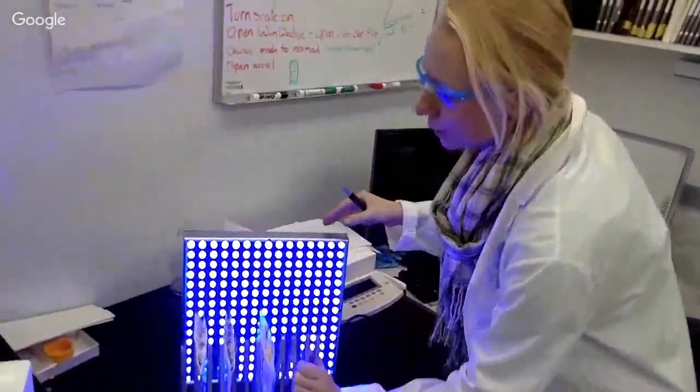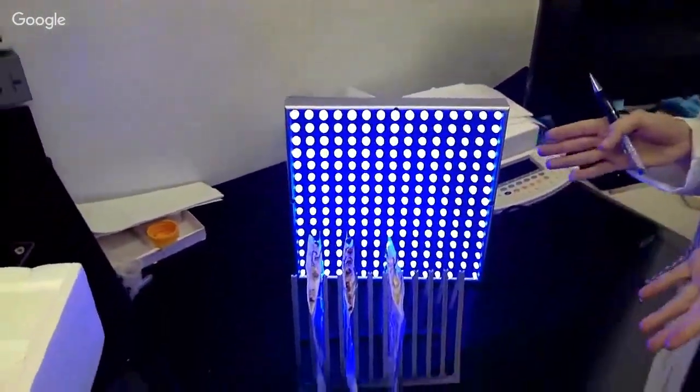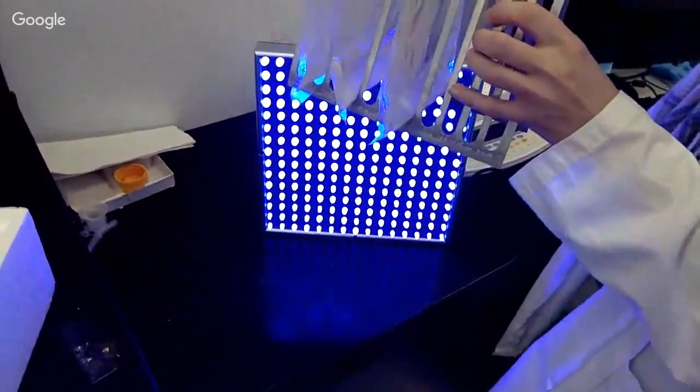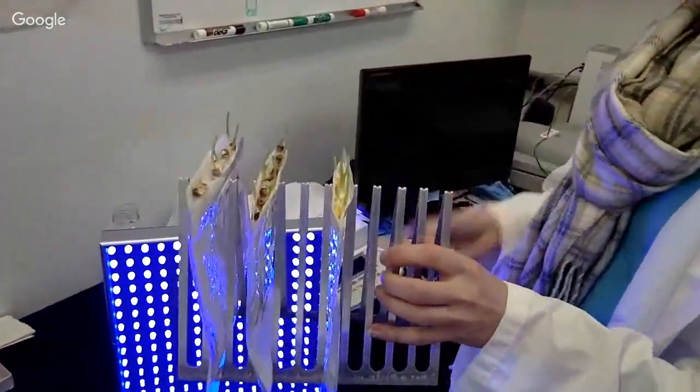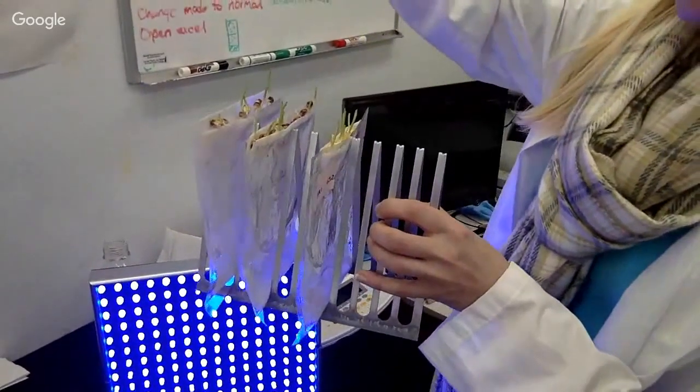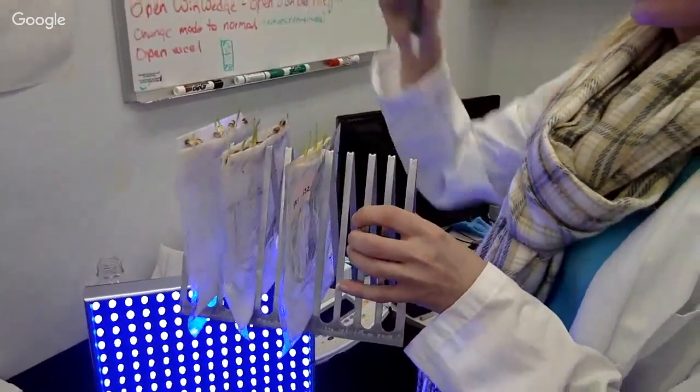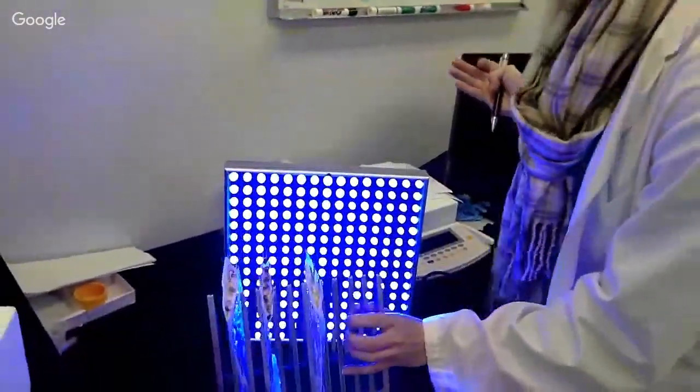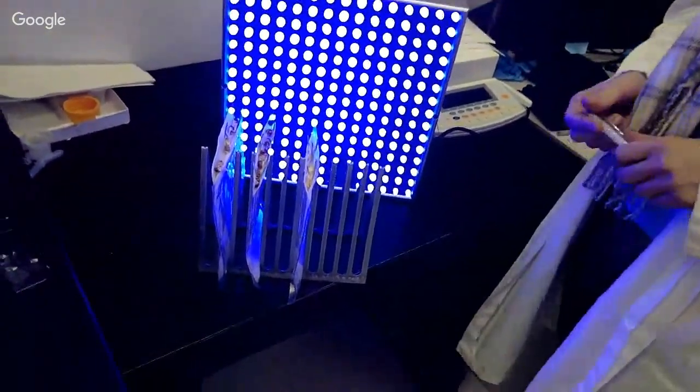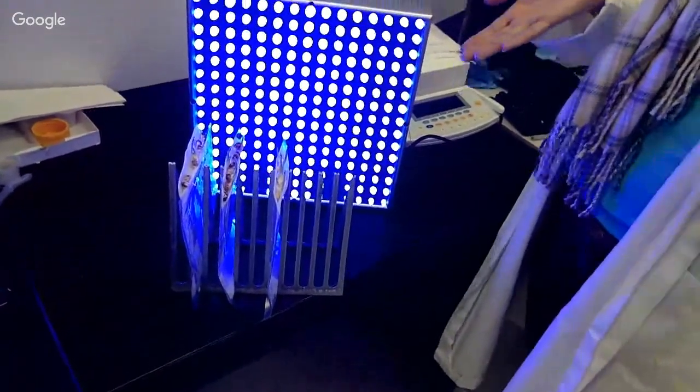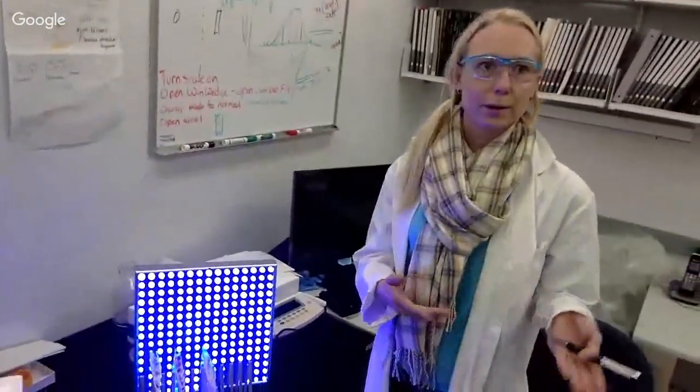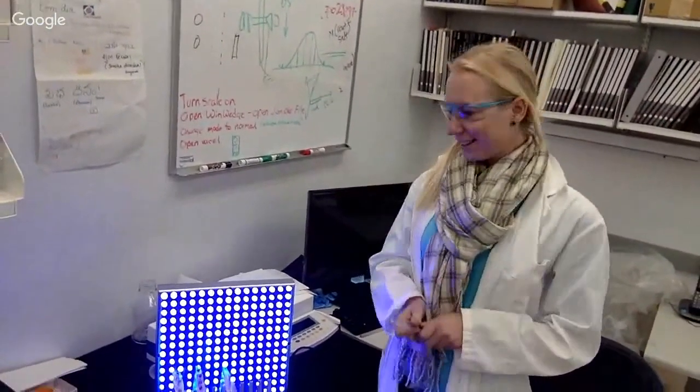They're six days old and the experiment is that you put blue light on one side. Usually it's in the dark, I'm just demonstrating it here. The shoot is showing a curvature towards the blue light. This is because of a plant hormone, auxin. Auxin is moving to the other side where there's no light, and this leads to an extension of the cells. That's why the seedlings are growing towards the blue light. I have here different mutant lines and what I want to see is if there's a difference between different maize lines, if some of them are showing different curvature after a few hours.